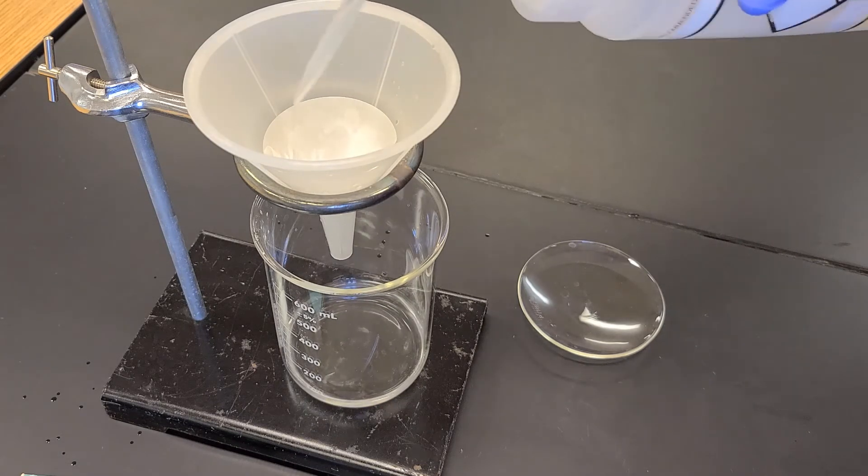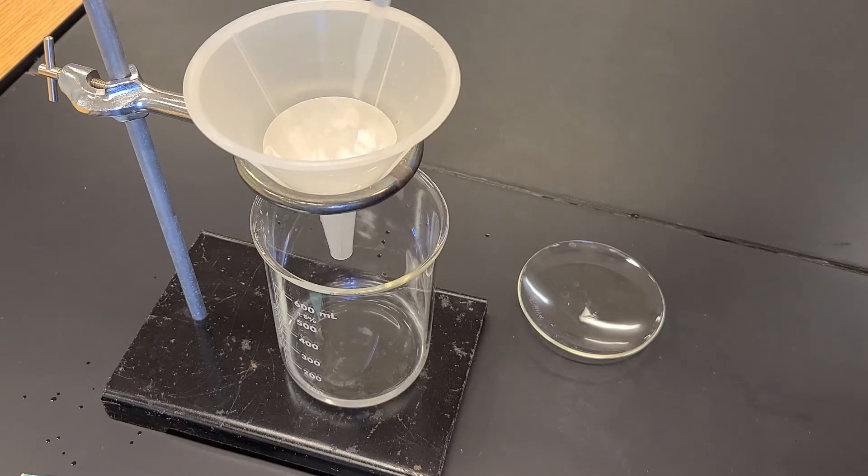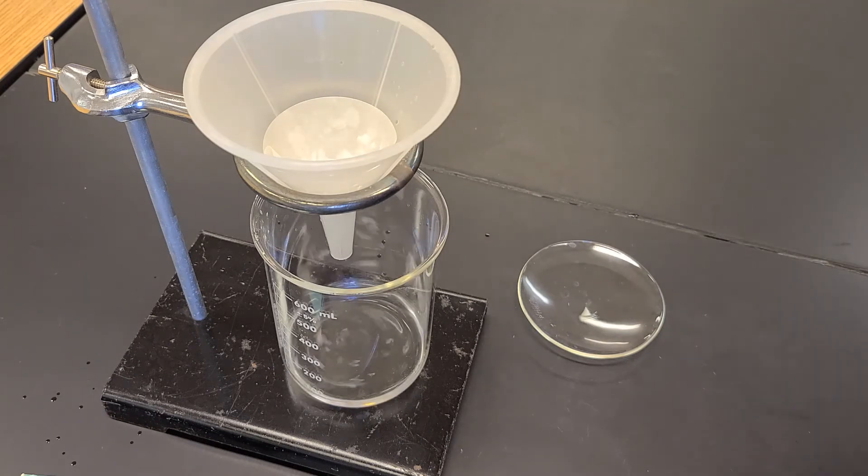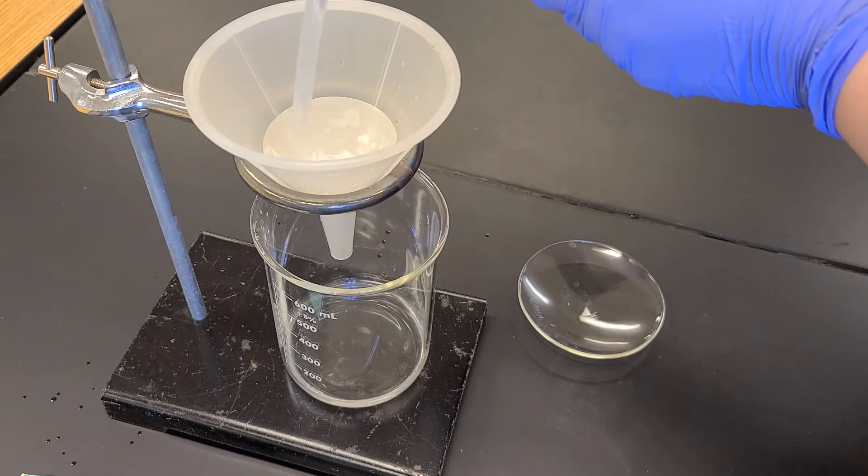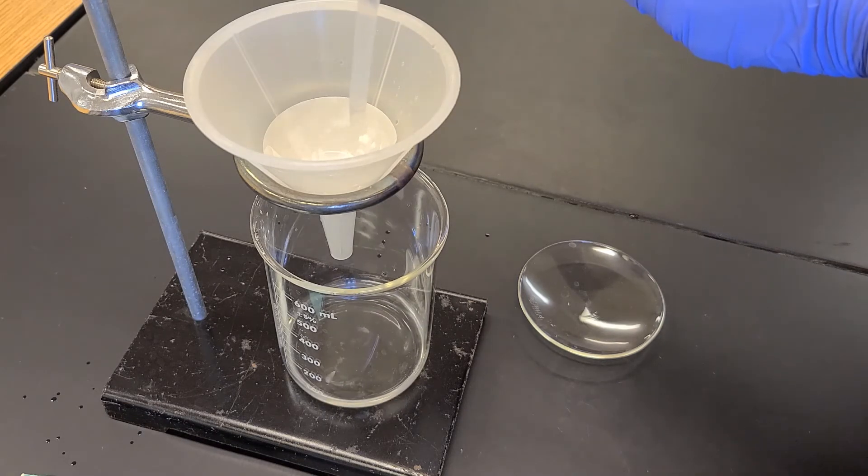Now I want to wash the precipitate. I want to make sure that none of those spectator ions like my sodium ions are stuck to my precipitate because that will increase the mass of the precipitate.